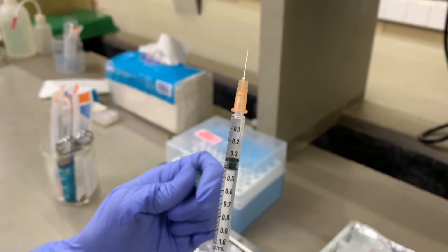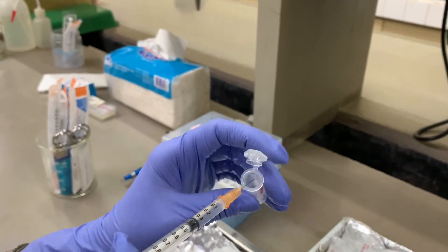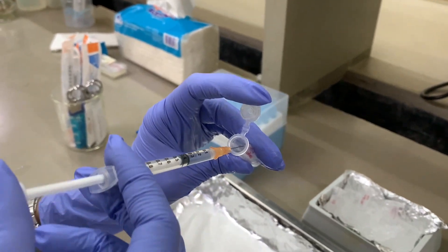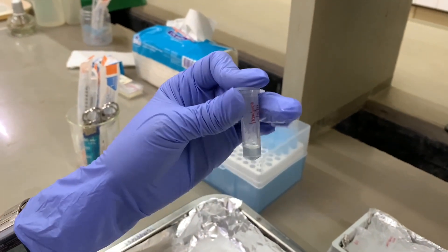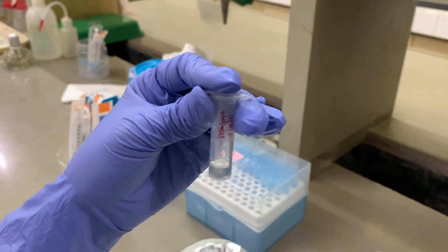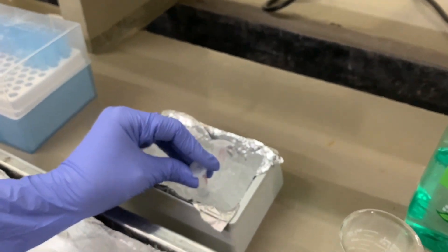Transfer the extracted hemolymph into a microcentrifuge tube. While waiting for the hemolymph to be counted, place your samples on ice. Alternatively, if you won't count the hemolymph right away, you can add 10% phosphate buffered formalin and keep your samples at equal temperature to preserve the cells.